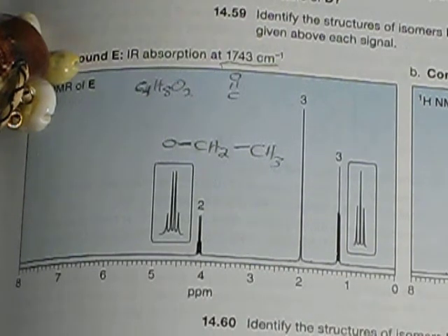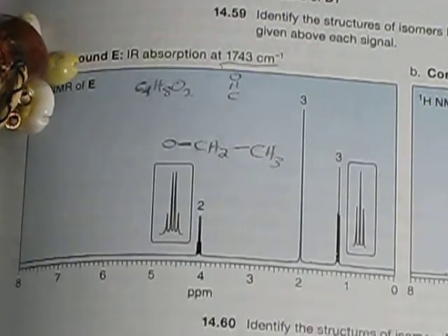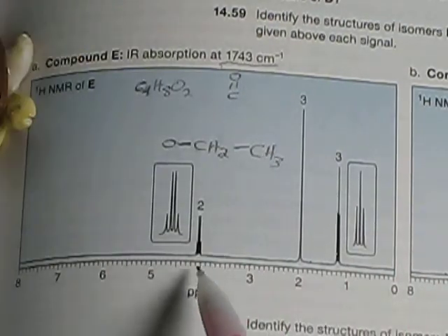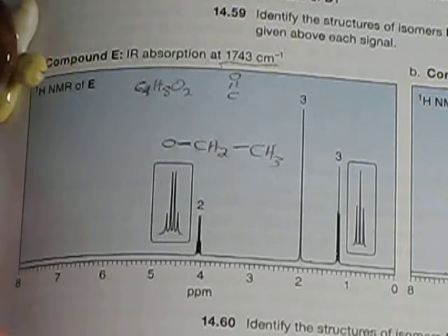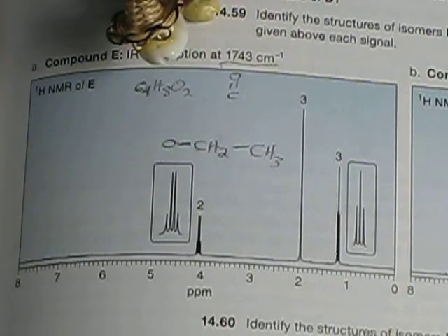Now, at this point, we could use our brains or we could just keep plugging along. It's up to you. But let's just keep plugging along, shall we? We've got OCH2CH3, we have our carbonyl. Okay, that's this peak. Myopic Turtle got bored. Myopic Turtle already knows NMR. Okay, so moving on down.